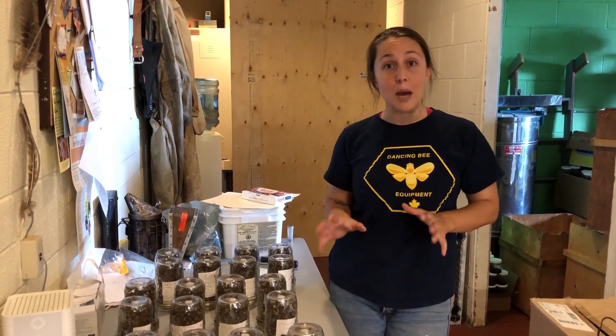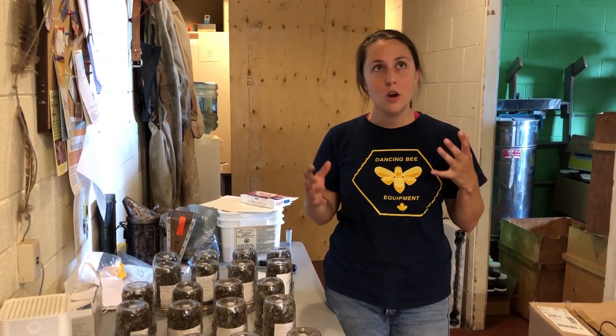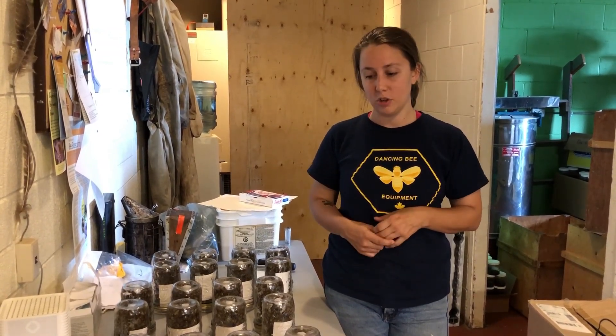We're going to leave them in a warm, dark place overnight where they can just run around. The mites will succumb to the chemical and fall onto the sticky board, and we'll revisit them tomorrow after the time period. In terms of temperature, it should be around 22 to 29 degrees Celsius for an effective Pettis test, and it's better if they don't have a lot of sunlight or light coming in because that can disturb them quite a bit.